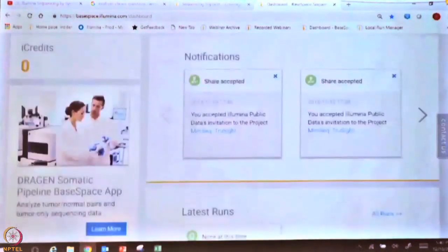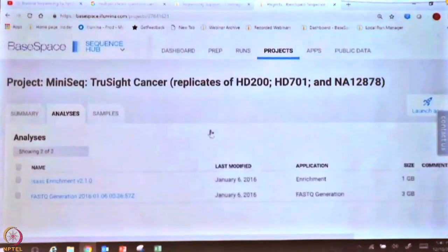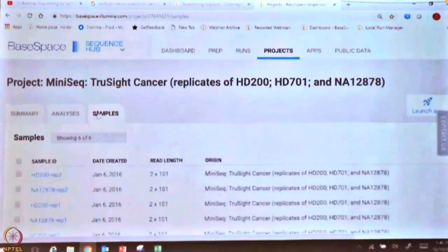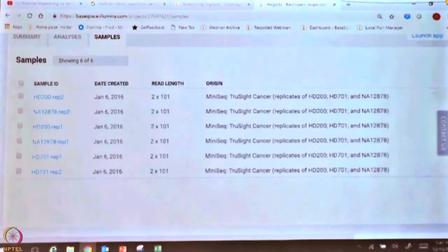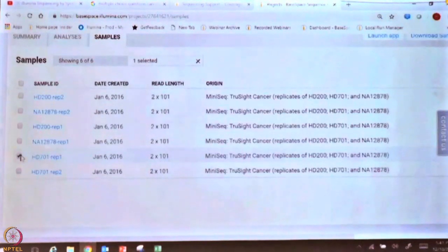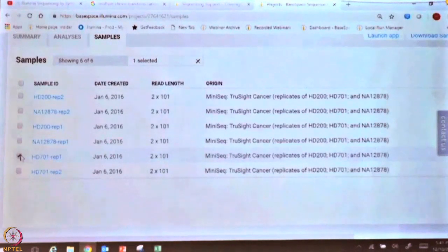Click on the notification that says MiniSeq TruSight Cancer, then go to the samples tab. Take one of the samples — the second-to-last one, which says HD 701 rep 1. This is a reference sample from Horizon, a company that provides reference RNA and DNA samples so you can check the quality of the data and the panels that you have developed. It is essentially QC data, which is why it is easy to demonstrate.